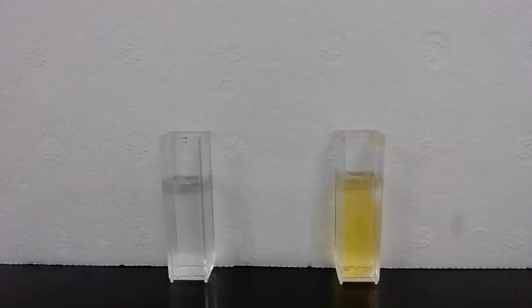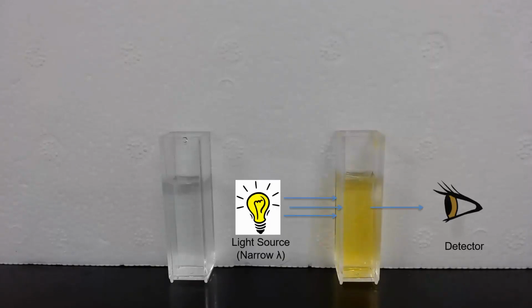A spectrophotometer will provide a quantitative measure of how fast the yellow color develops. When we put a cuvette into the spectrophotometer, it shines a specific wavelength of light through the reaction, and a detector on the other side measures how much light made it through and how much was absorbed. The more O-nitrophenol is present, the higher the absorbance will be. Measuring the change in absorbance over time tells us the rate at which O-nitrophenol is accumulating, and thus the rate of the reaction.